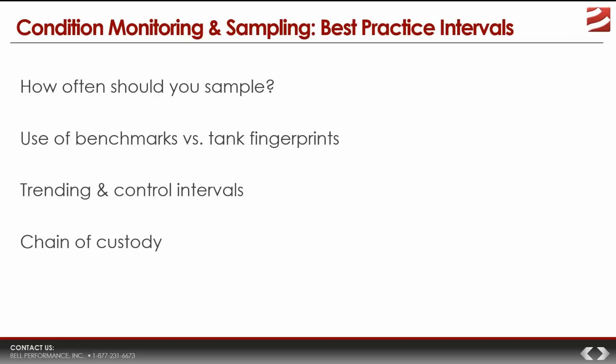Now, a typical chain of custody form will give you enough information to document who had the sample at what point in time, what is intended to be done with the sample, and who did the work or who is going to do the work. Bottom line, every good lab uses chain of custody forms because they are important. They can even be important legally as well. They can be legal documents.